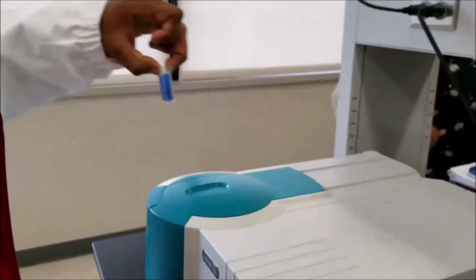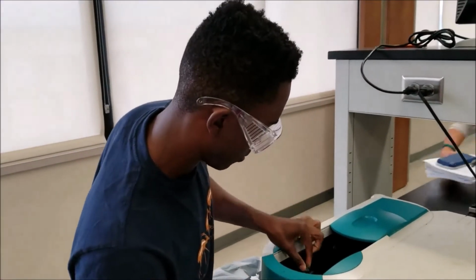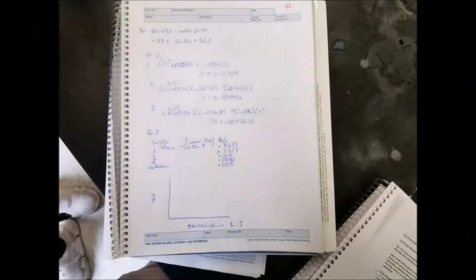We then use the lambda max value to make a scan at a specific wavelength for the stock solutions and the dilutions. After collecting the absorbance values for the solutions, we can use the relationship between concentration and absorbance to find unknowns.